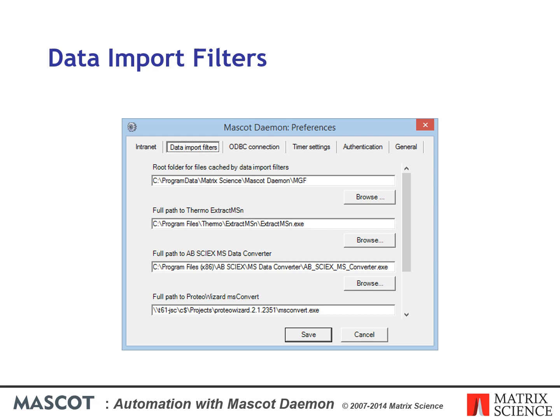All other data import filters must be configured on the Data Import Filters tab in Preferences. Install the package, browse to the executable, and save.